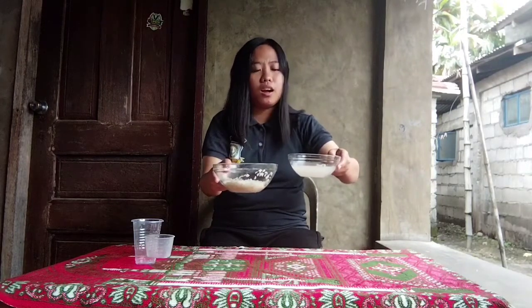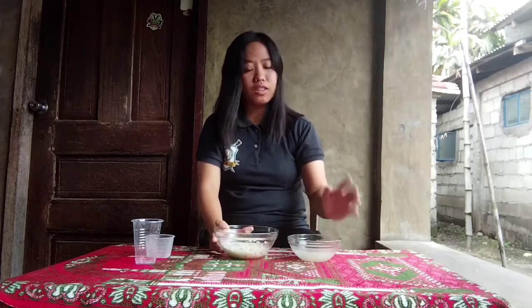And that's how the two mixtures are separated. And that's the process or technique on how to separate two mixtures using decantation.